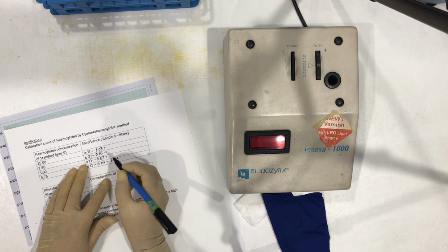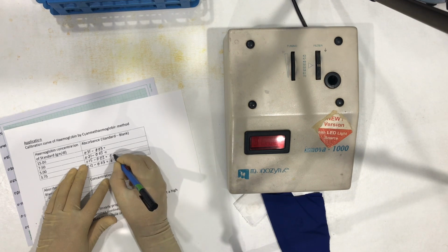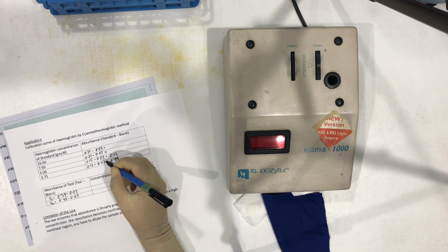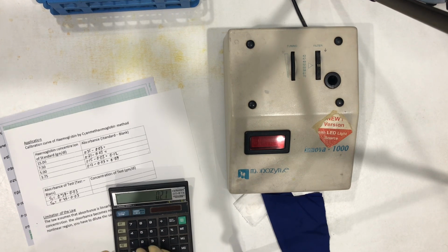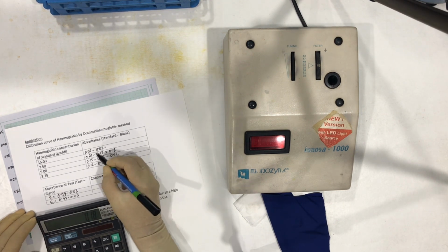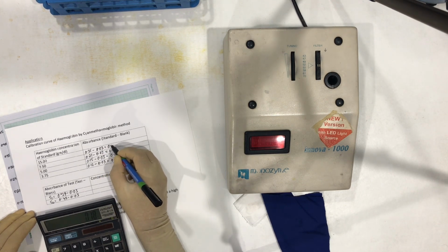0.15 minus 0.03, 0.12. 0.21 minus 0.03 will give us 0.18. 0.35 minus 0.03 will give 0.32.